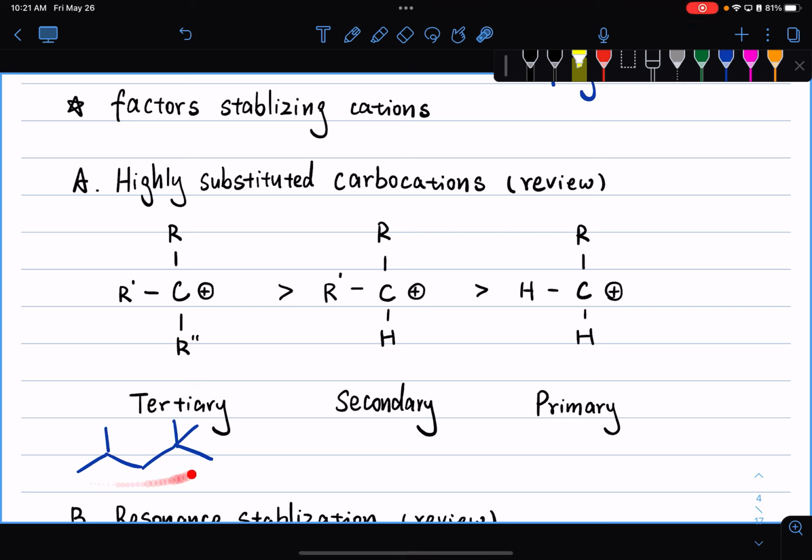So let's imagine this random molecule I just drew. In this case, we can break it in several different pieces. They're all carbon-centered carbocations. Now, if we break it at this point, you can imagine we're forming a carbocation that is tertiary. So in this case, formation of that tertiary carbocation is more favored. And because we're forming the more stable carbocation, this is more likely to act as the base peak for the mass spectrum of this molecule.